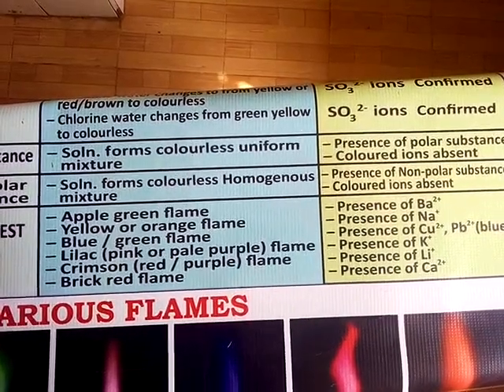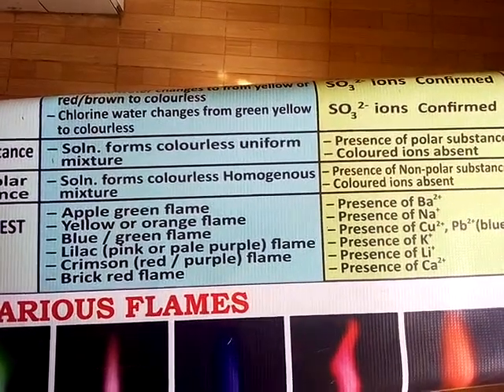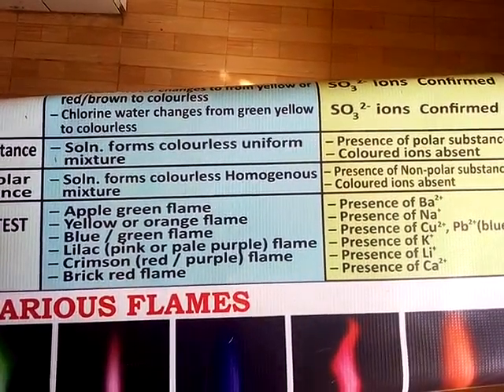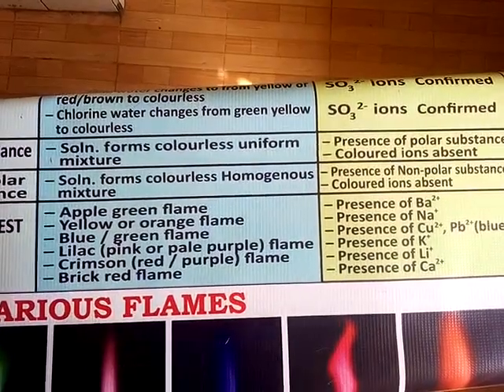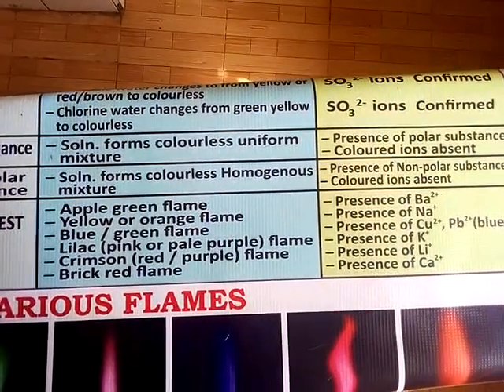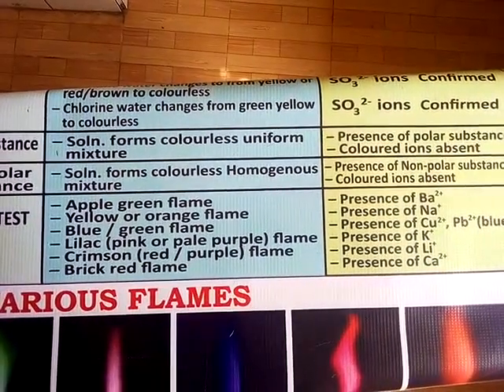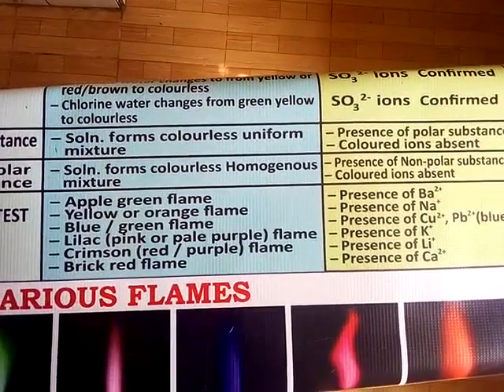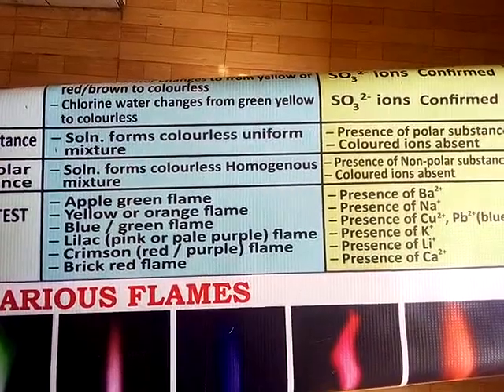This is what we call a flame test. Various ions, or the cations I mean, produce different colors when you burn them.